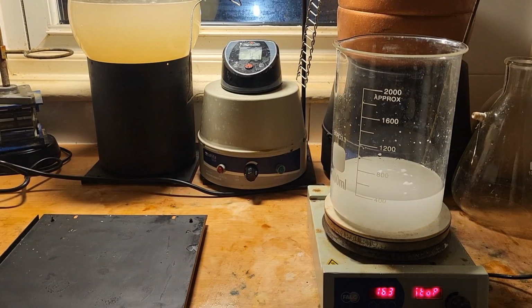We want to heat this on the hot plate until it dissolves with stirring. This dissolves quite quickly.